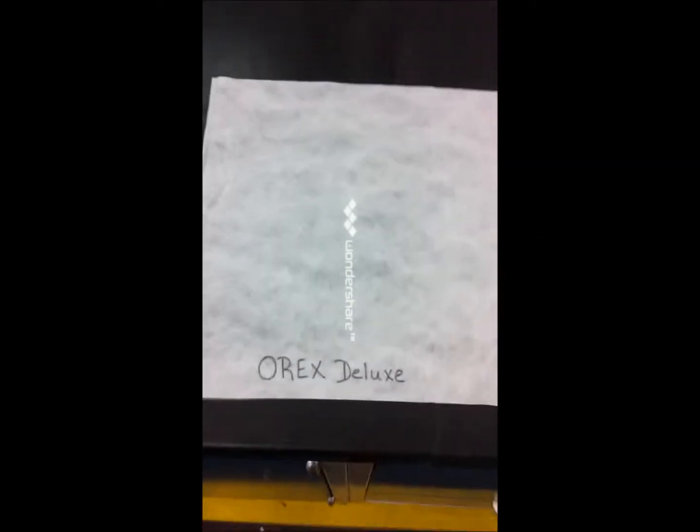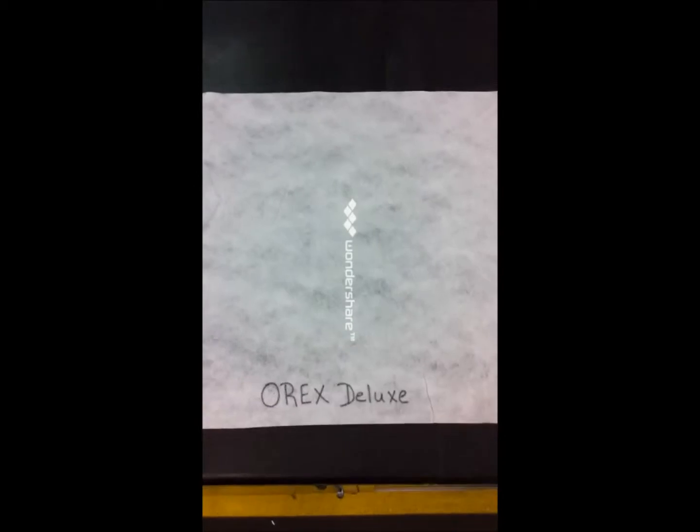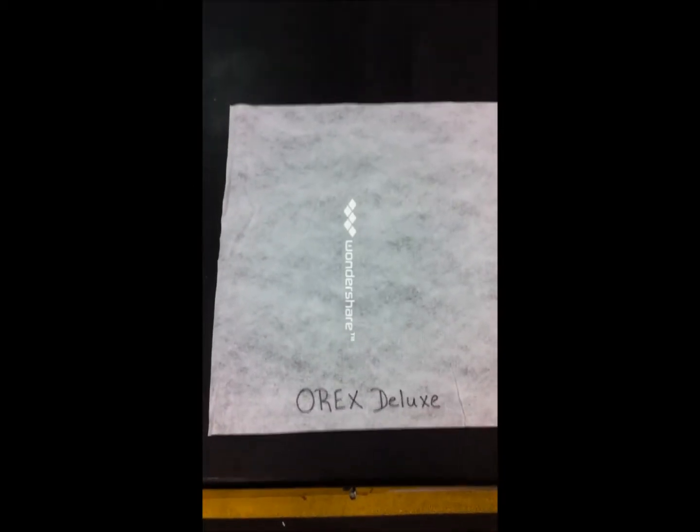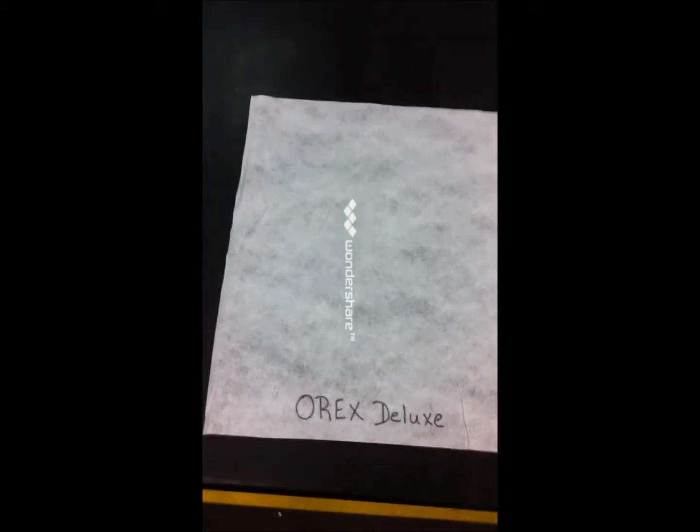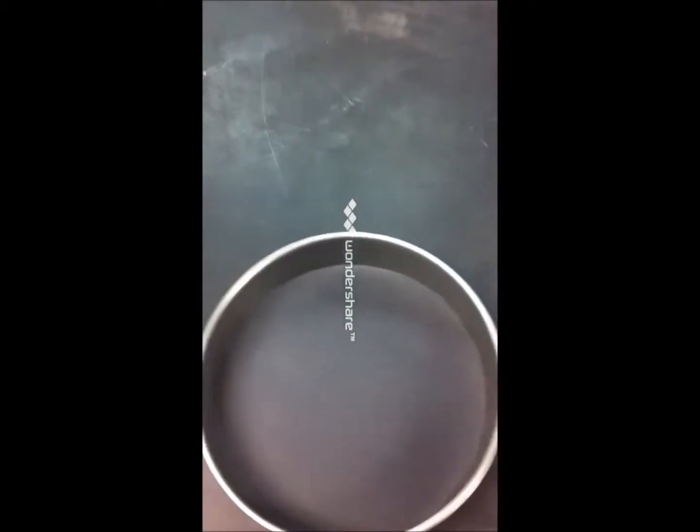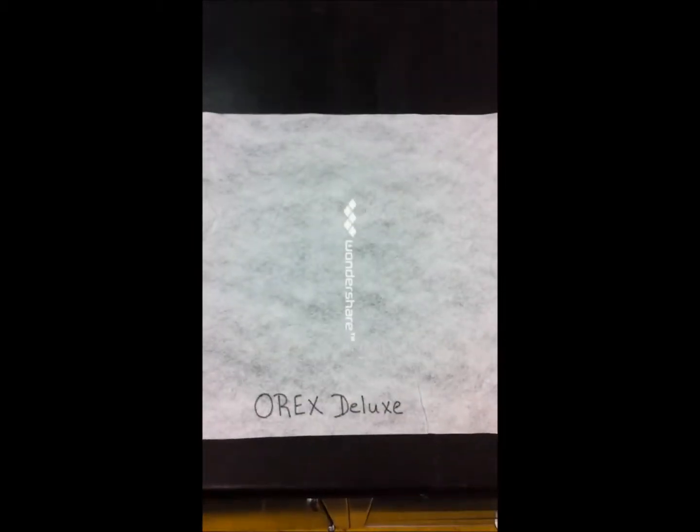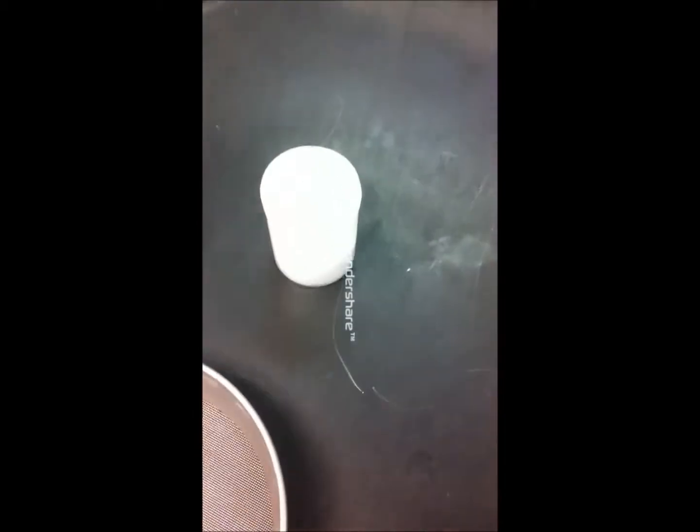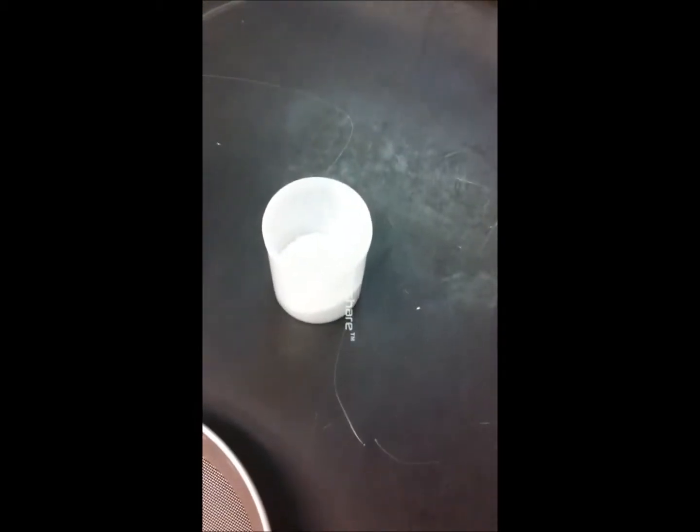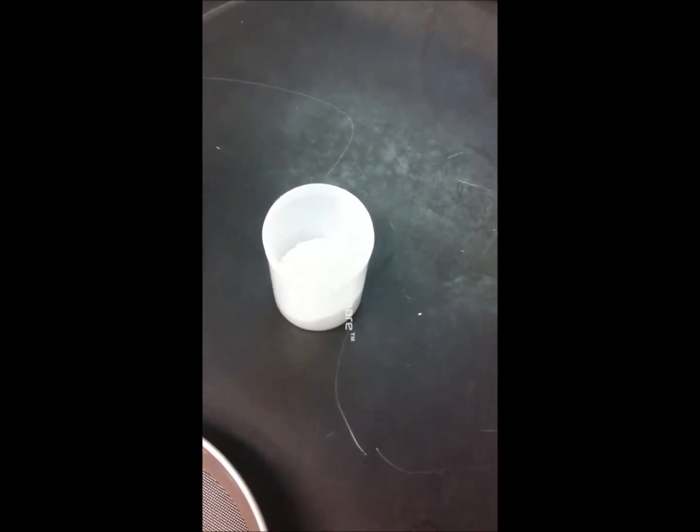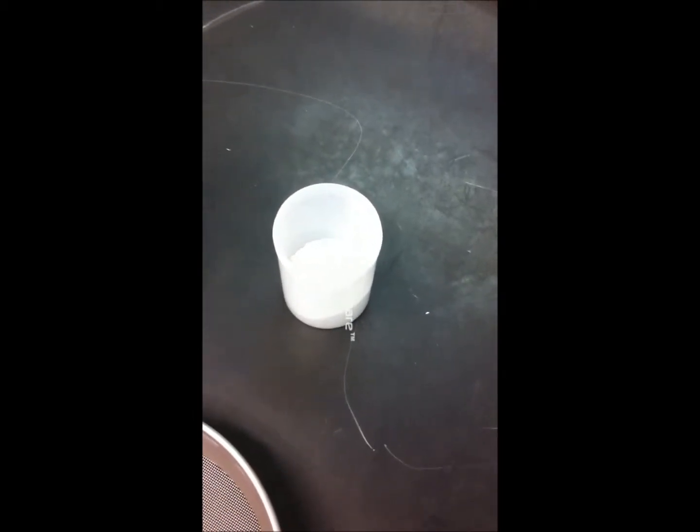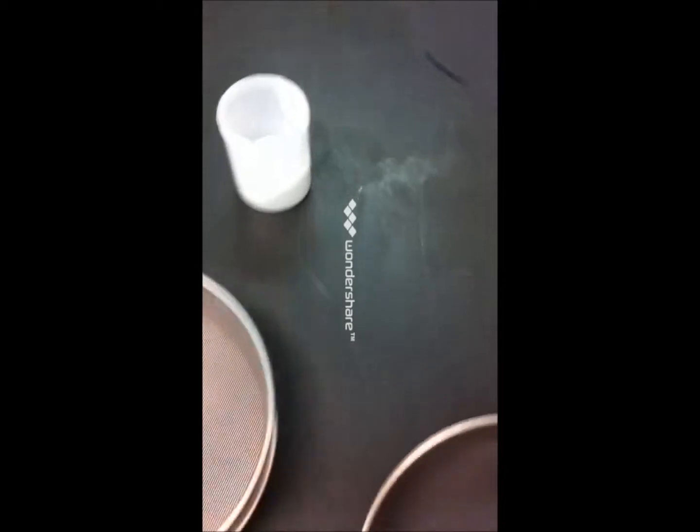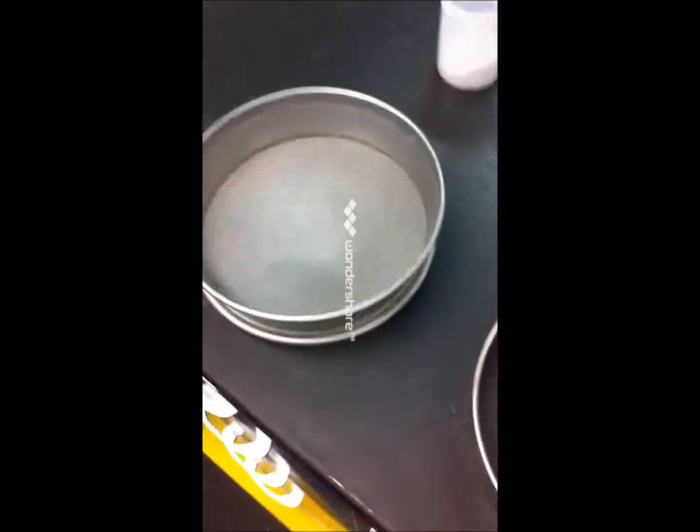We are going to test some Orex Deluxe fabric today in regards to the amount of particle filtration it will allow through or hold out. We're going to take a standard talc powder, 25 grams worth, and we are going to place it on the fabric.